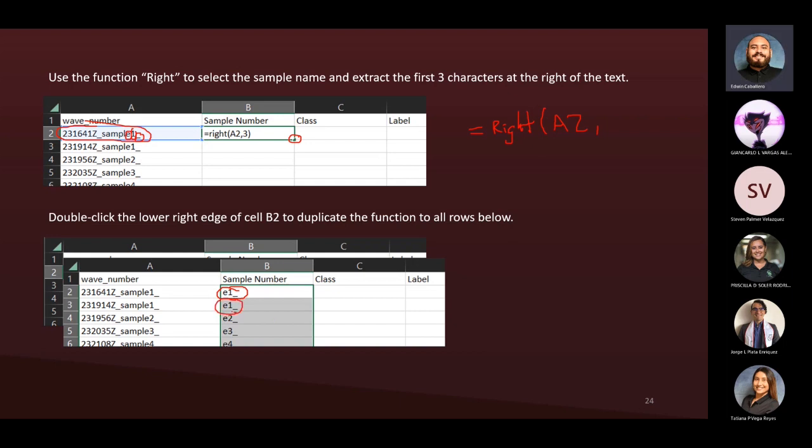automated all the numbers. Now you might say, Edwin, it looks a little bit weird, right? How you have this, this, and this. Well, that's specific to the way the sample file was named. That's specific to how the sample was named. I'm going to show you how I get rid of this specific thing, but it is a specific case. What's the best thing you can do? I'm going to show later.